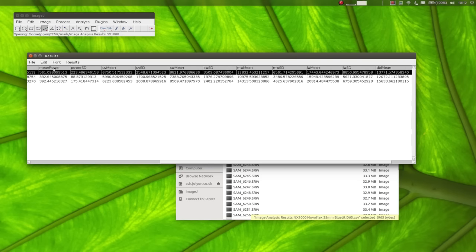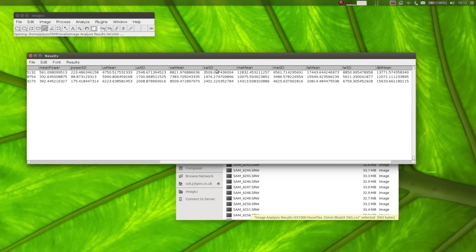These results, the descriptive pattern statistics, are obviously only shown if you chose to do pattern analysis. If you didn't do pattern analysis, then it shows you all of the color measurements here. Here we have the UV mean and the UV standard deviation for the snails 1, 2, 3. And then the short wave, medium wave, and long wave, and double.